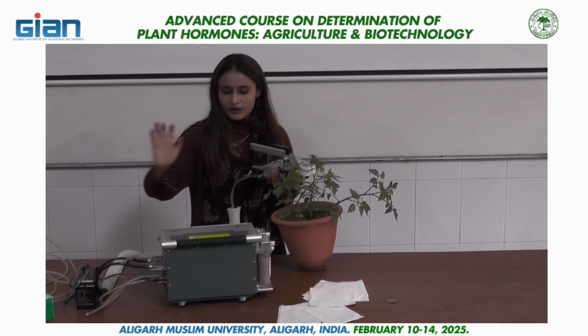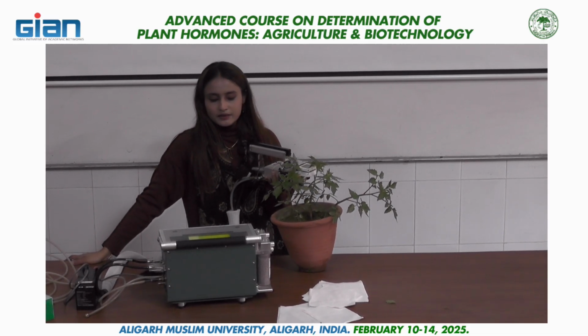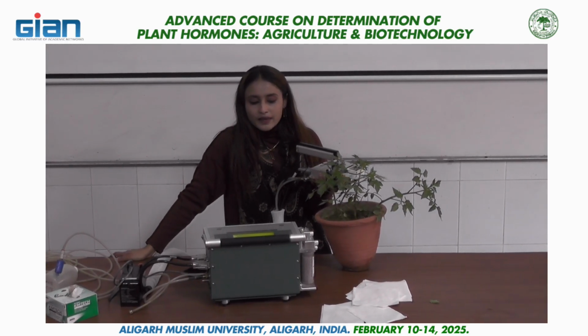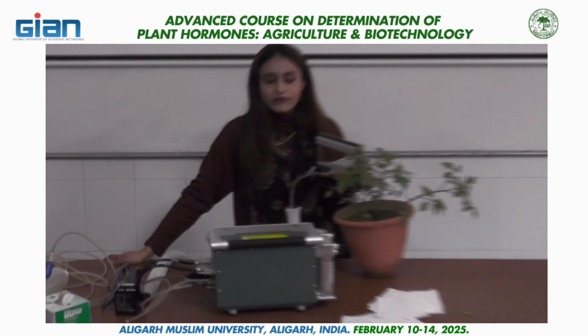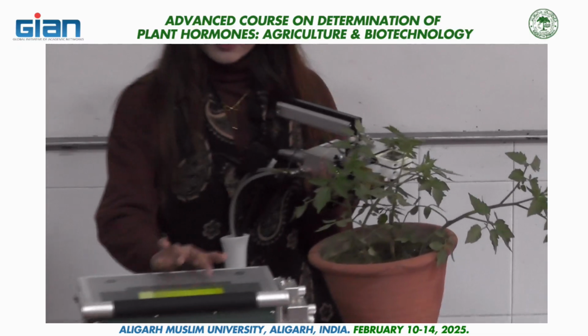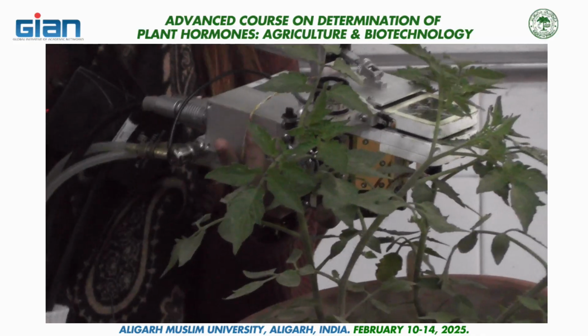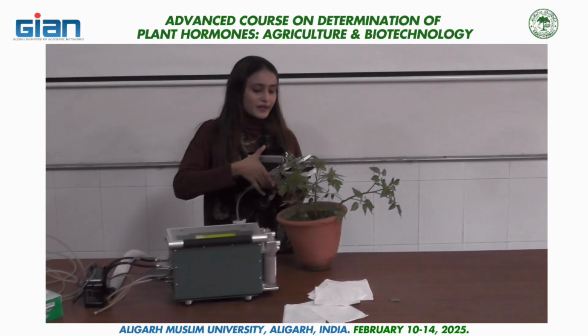Again, now I am selecting enter. We are getting 24 here. So okay, fine. Press F1 three times, then F4. So these are the readings.